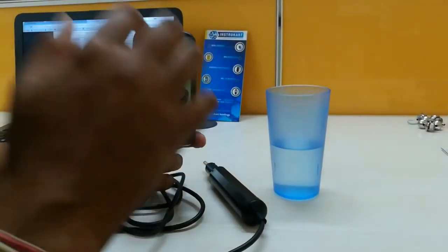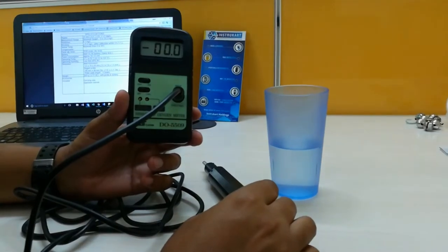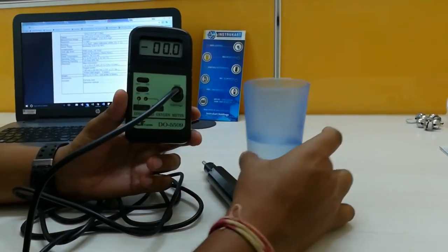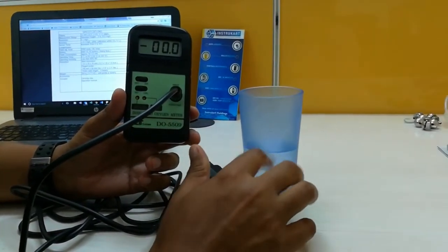The operating temperature for this is 0 to 50 degrees, which means that the water temperature should be 0 to 50.